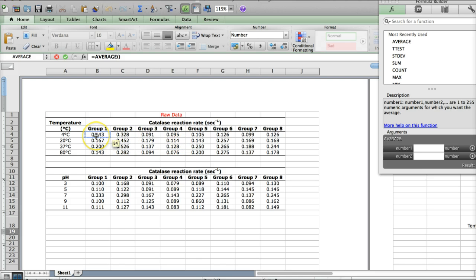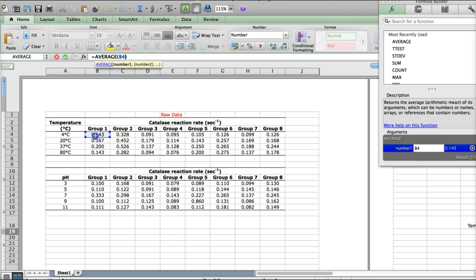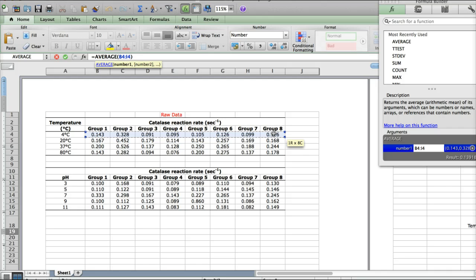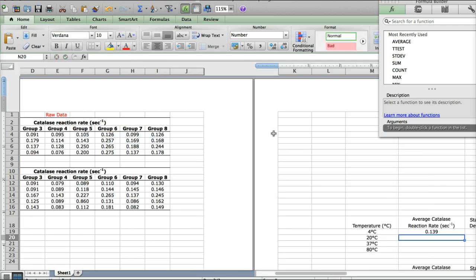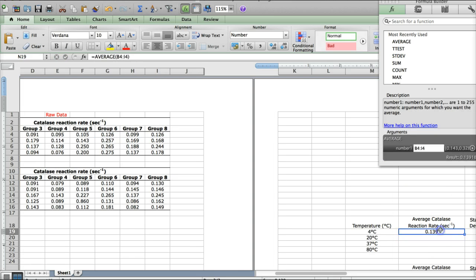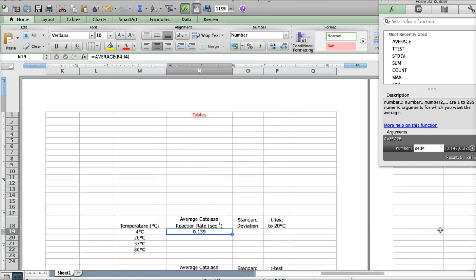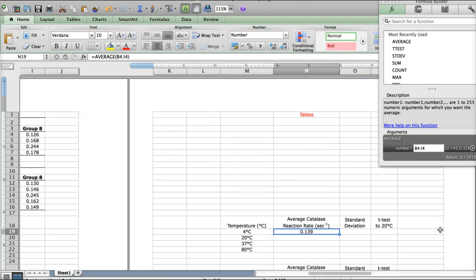Once you have this little area up and it's asking you for the numbers you want to average, you scroll over to the raw data, click, hold, and select all of the numbers you want to average. We're just going to average all of the measurements for all of the groups at four degrees Celsius. Then you can hit enter and your number will appear in the box. This is the average for all of those time points.